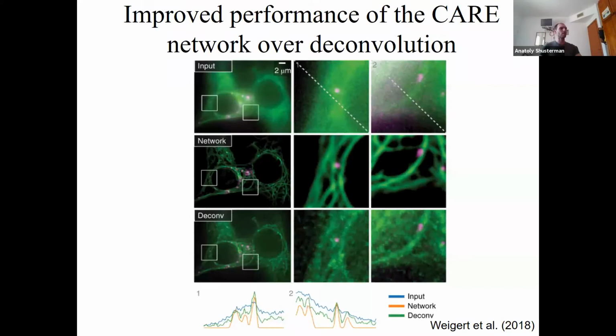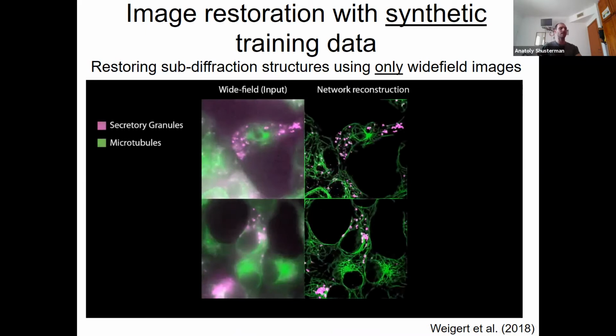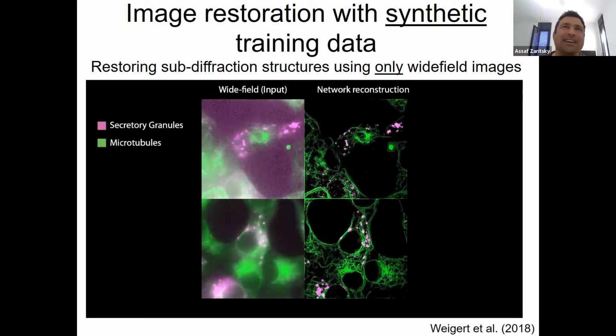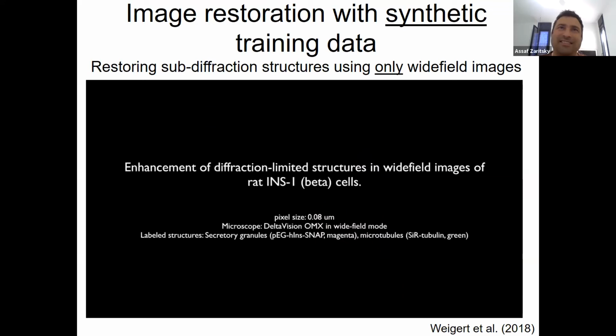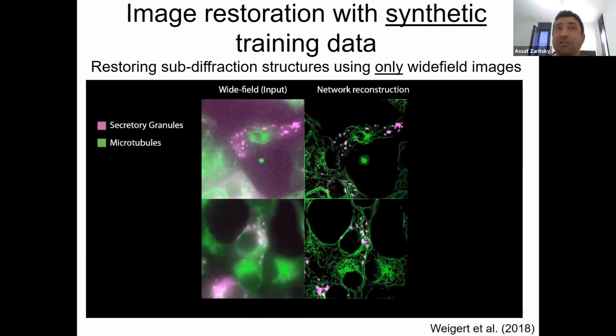Can we measure this directly after the reconstruction, or is there a metric for each purpose of the data? Yeah. I mean, for each data acquisition we have a problem that we want to solve, right? We want to ask a specific question. Then this is exactly what you are alluding to: yes, we need to define the right measurements per the application, per the questions that we want to ask. This is very important.